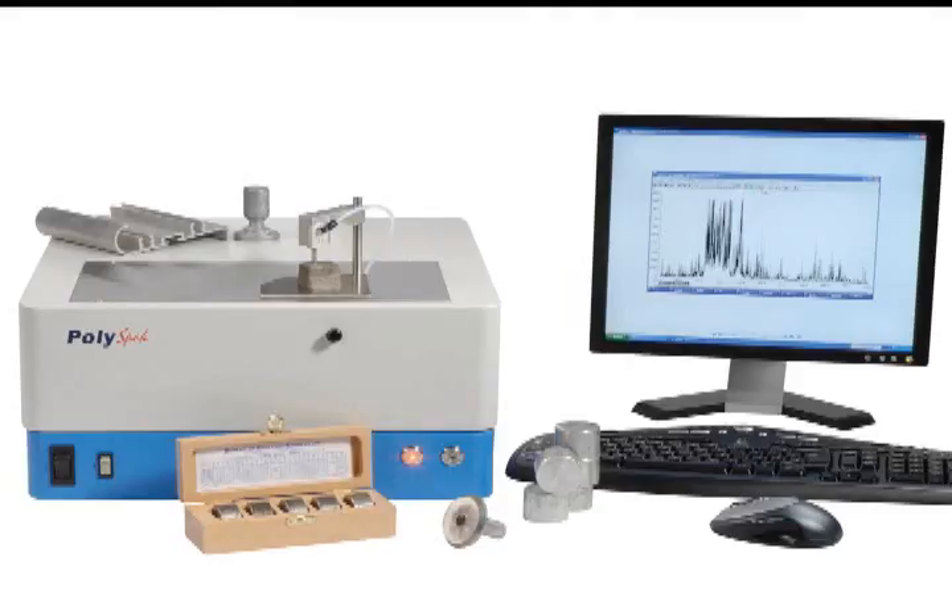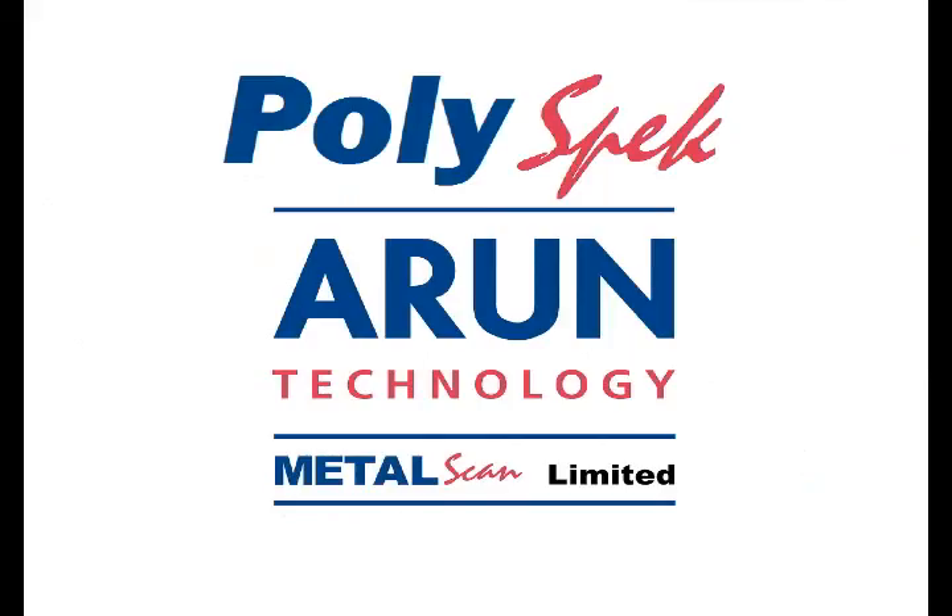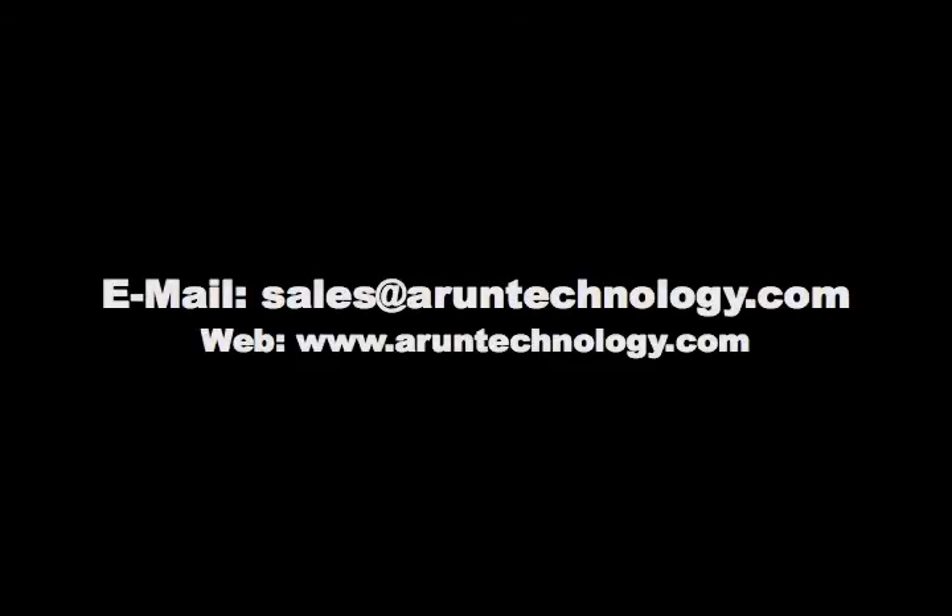The PolySpec desktop spectrometer is an advanced yet affordable spectrometer that can be used for a variety of applications. Please contact us to find out how a PolySpec series spectrometer might fit your specific needs.